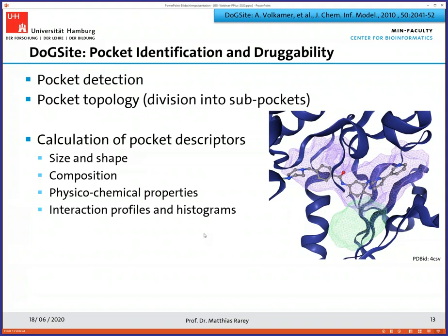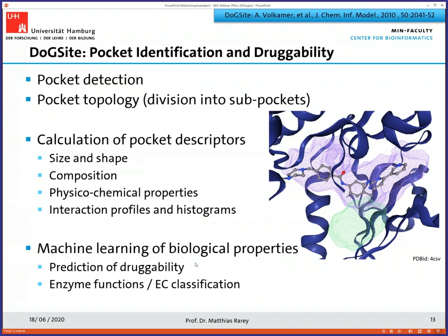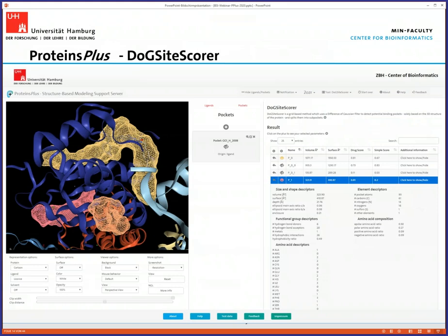With these descriptors, we run a machine learning approach which gives us a prediction of druggability. To my knowledge, DoGSiteScorer is still the only web-based druggability service. In Proteins Plus, this looks as follows: you see the protein structure, you can see the individual pockets which have been calculated, switch them on and off, and see the shapes of the pockets. For each of them, you can also get all the descriptors we have calculated — a druggability score, geometric criteria like volume and surface — and you can start using this data. Whatever you calculate with Proteins Plus can be downloaded.